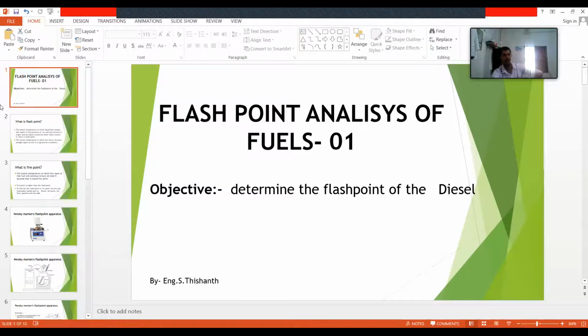Because petrol has a lower flash point than room temperature, that is difficult for the next practical. But somehow we did it, and we didn't find out the flash point, but we recorded a video of what is happening when we introduce the fire at room temperature. So for next Monday, you will see that video. And I have somehow divided it into two reports, two sessions.